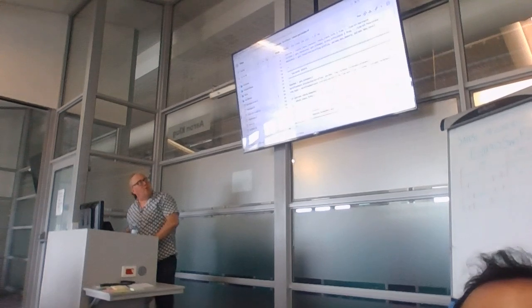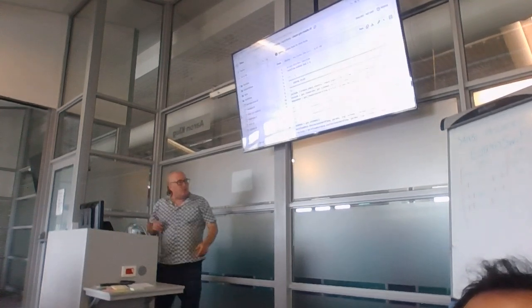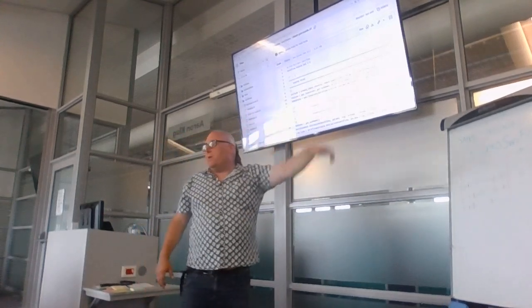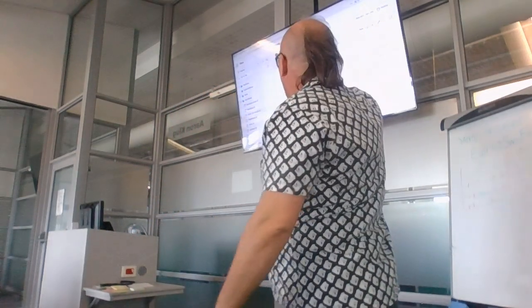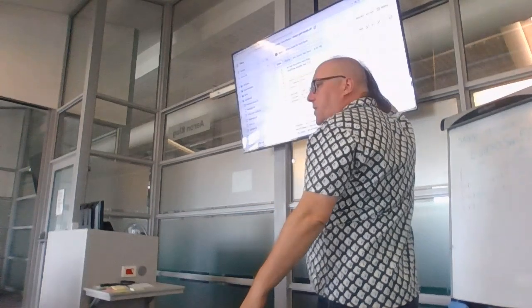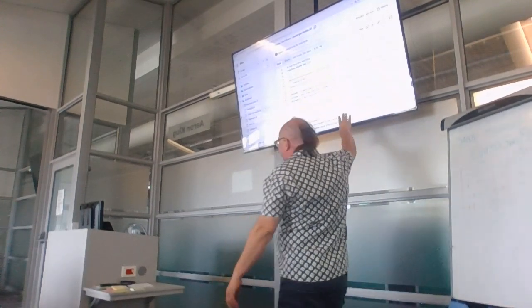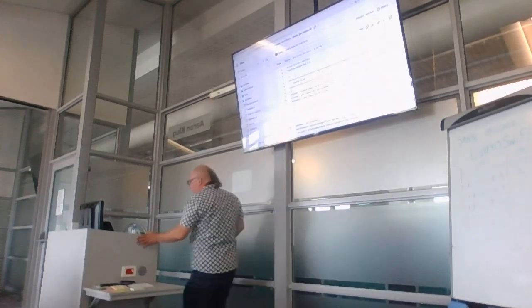If we look at what the code looks like at the top, then we see it says Nextflow enable DSL2. So this is a DSL2 Nextflow workflow. Okay. Then it talks about some config files. We can skip over the config file section. It talks about validating the inputs. We can skip over that for now. I want to focus on what happens next.